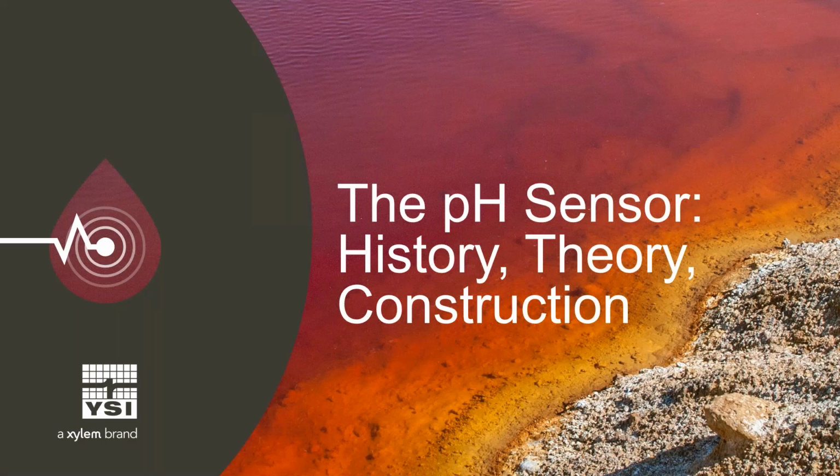All right, now we're going to move on to our next section. We're going to move on to the history, theory, and construction of pH probes.